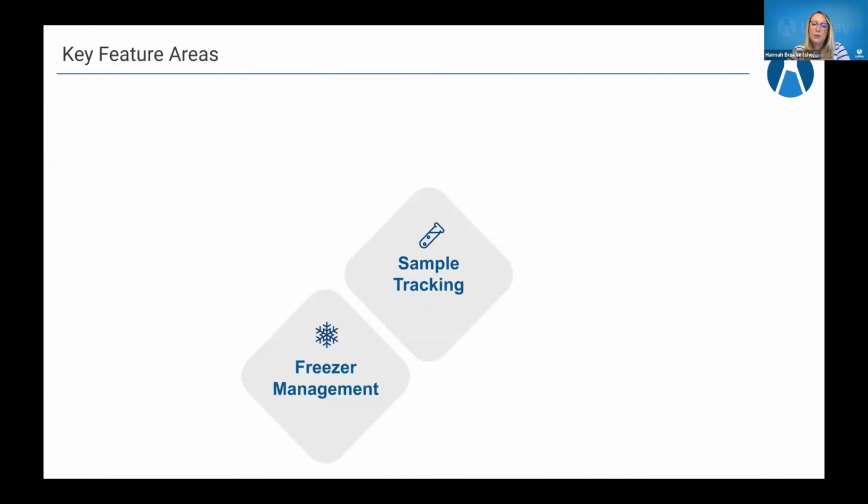We also have a freezer management component, which I'll be giving a bigger demo about later today. Really, all of the things that you would expect out of a freezer management tool, being able to customize your storage environment to what is actually within the lab itself, allowing for samples to be checked in and out, managing and tracking sample amounts, as well as those freeze thaw counts as they're coming in and out of the freezer.